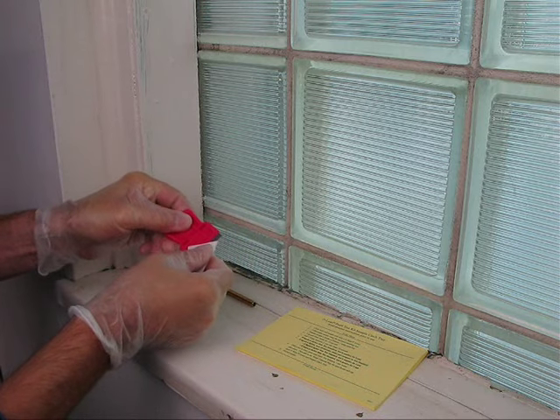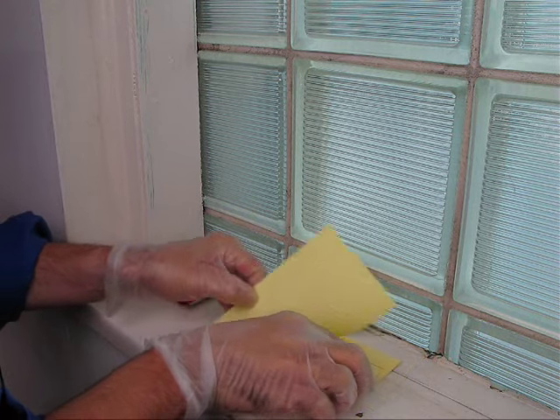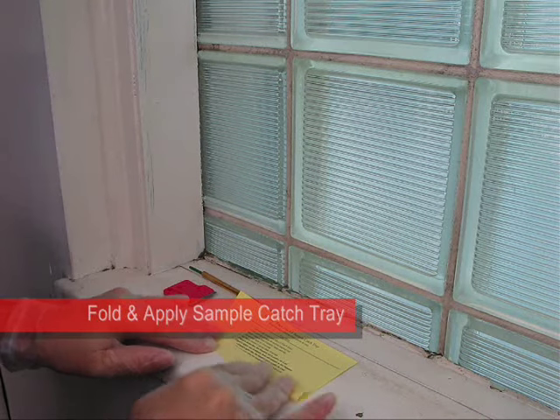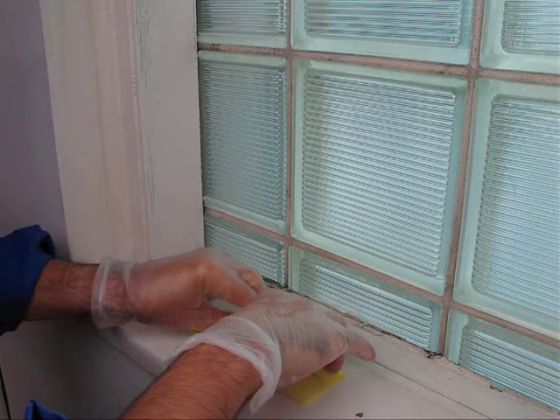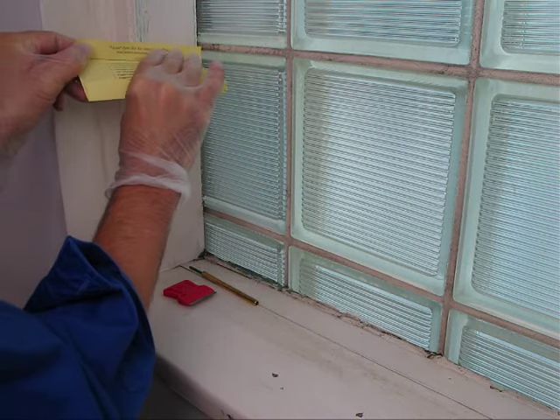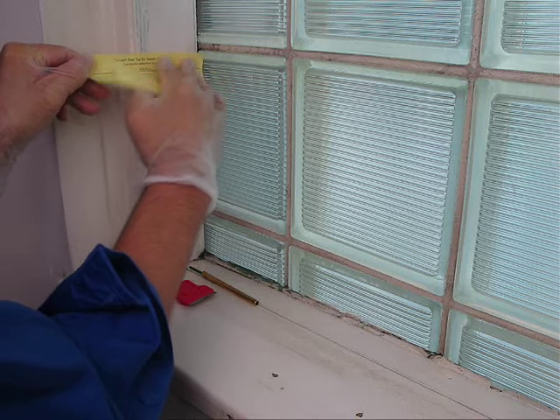Remove one sample catch tray from the pad and fold along the lines to make a tray. For vertical surfaces, use the adhesive edge and attach the catch tray directly below the sample area to catch all of the sample paint chips.